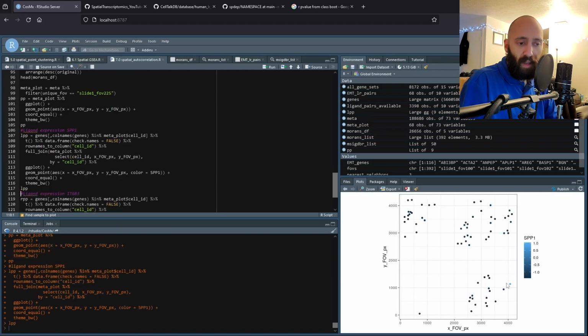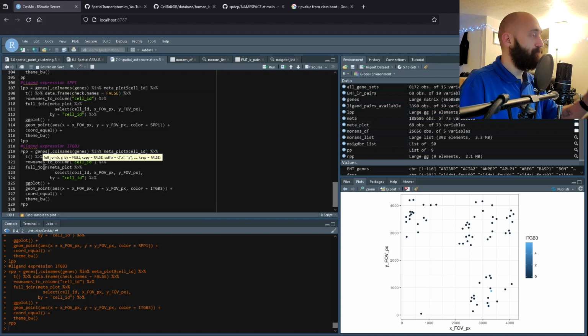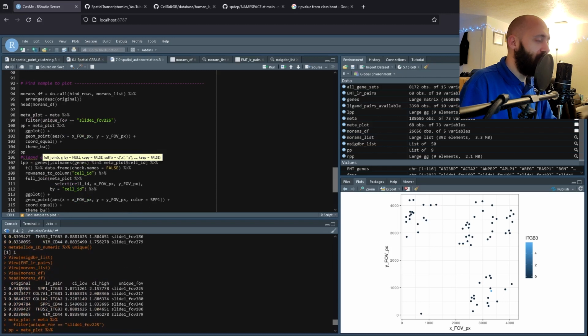Okay, we have one really high here. Otherwise, it looks like most of it is very low. Maybe some moderate up here since it is normalized. Maybe one down here. If you look at the receptor expression, we can also see that it's a couple genes and the region just happens to overlap a little bit. But you have to take it with some critical thinking of whether this actually makes sense. So let's go ahead and look at another one here.